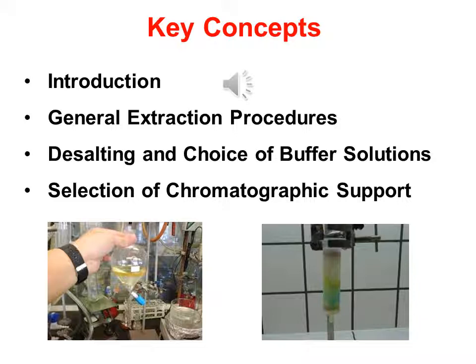In this method, compounds are distributed in two solvents according to their different partition coefficients. This technique is highly effective as the first step of fairly large-scale separation of compounds from crude natural product extracts. In this lecture, the generic protocols for the separation of the water-soluble natural products will be discussed step by step.